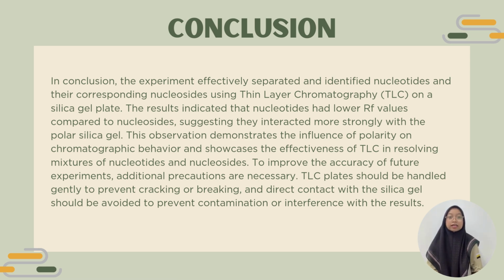In conclusion, the experiment successfully separated and identified nucleotides and their corresponding nucleosides using thin layer chromatography, or TLC, on a silica gel plate. Through this process, we observed that the nucleotides had lower RF values compared to the nucleosides. This suggests that nucleotides interact more strongly with the polar silica gel, likely due to their additional phosphate groups, which make them more polar. These observations demonstrate how polarity plays a significant role in chromatographic behavior.